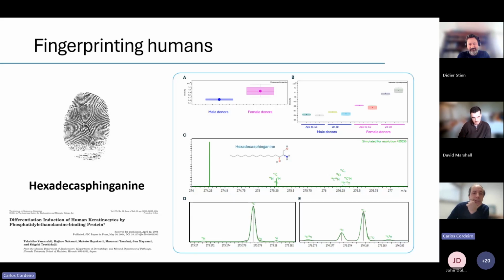So if I enhance a region of the very complex spectra we have, we can clearly see the isotopic distribution of carbon. This you can see on any regular high-resolution mass spectrometer. But what you can only see on a magnetic resonance mass spectrometer across the entire range is actually the so-called fine isotopic structure. So if you look at the carbon-13, you will see there are tiny little peaks here that actually match deuterium and nitrogen. This shoulder is oxygen. But if you go to the third peak, you'll see a few more things, and the fourth peak, and so on.